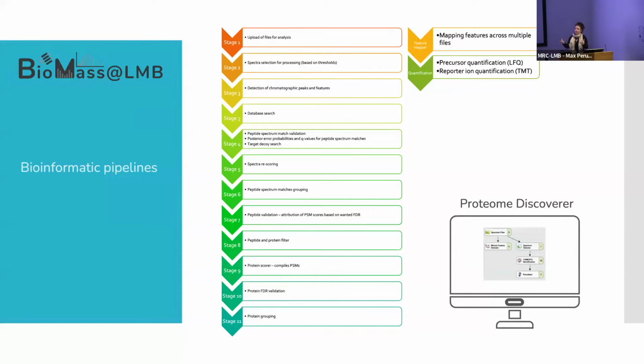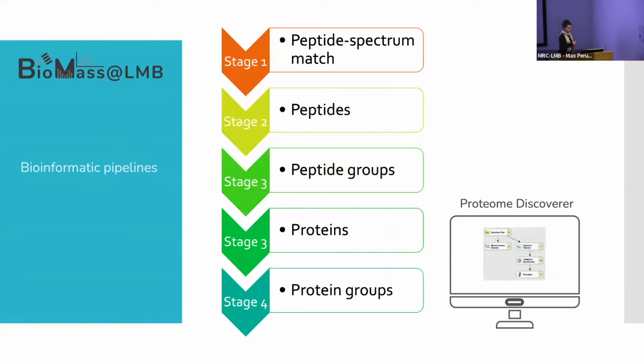So for a good analysis, you come back to us, right? Can I see these? And we want you to do that. So in no situation do we not offer support for that. So this ongoing communication. There's obviously lots of things that these softwares do behind the pipelines, but the most important thing that I want you to have an idea of is the levels of information that you have in PD.